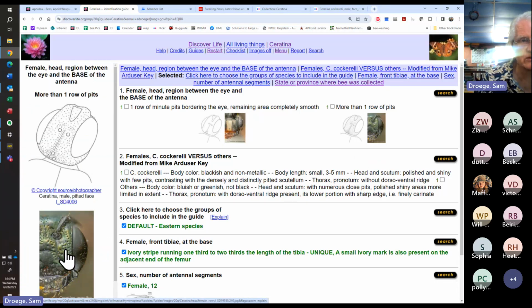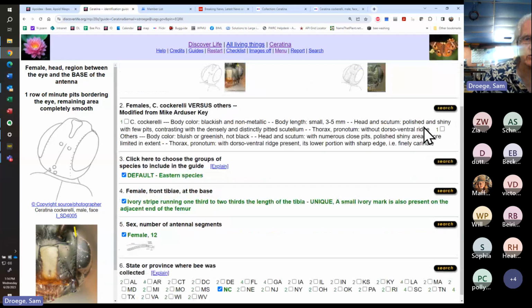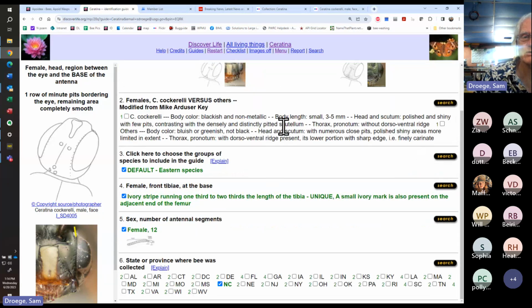And then in the other species, you can see here from the side, I think that's David's shot there. You can see there's tons more pits along the edge. And if we look at the row here, it's just this one lonely little row. These are this dirt over there. So, but also just gestalting will take you to different places. So let's see what Mike says.